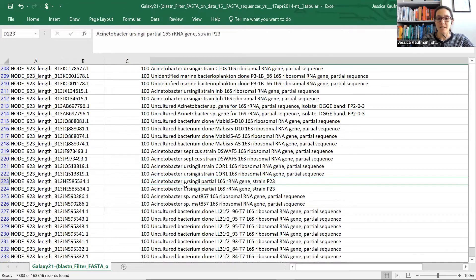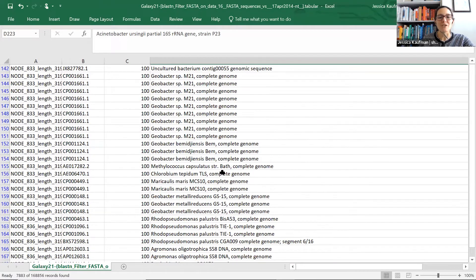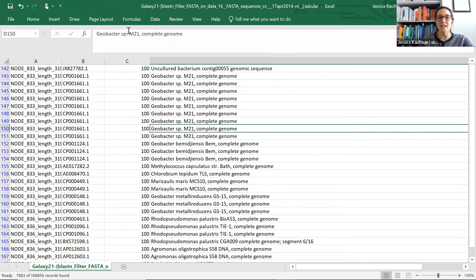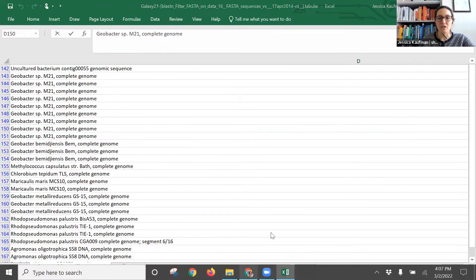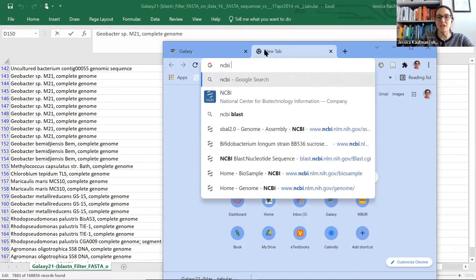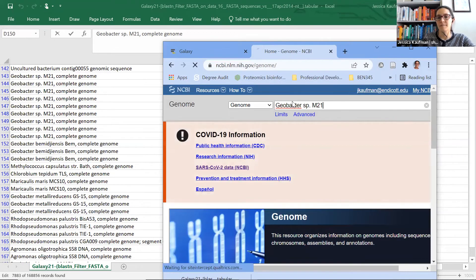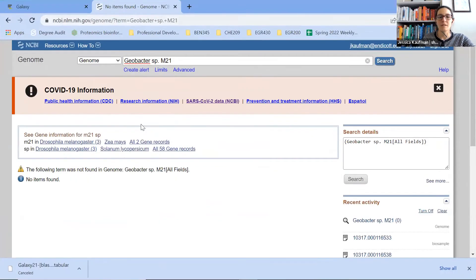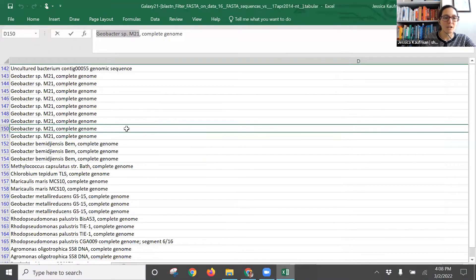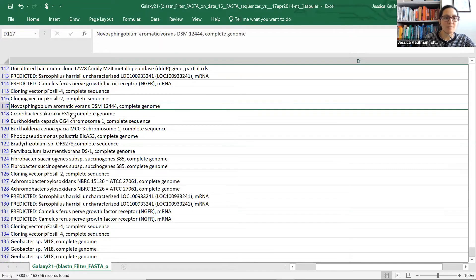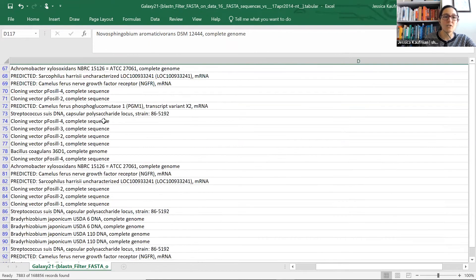I'm going to try Acinetobacter ursingii 16S RNA — that's a perfect match. Actually, it's not a perfect match because it's just a partial sequence. I'm not going to try that one. I'm going to try Geobacter sp. M21, and I'm going to go back to my browser and go to NCBI Genome to look up that particular genome. If I look on there, it doesn't find that genome, so it's not going to be a good one to use for the alignment. So I'm going to try to look up a different organism that also has a perfect match.